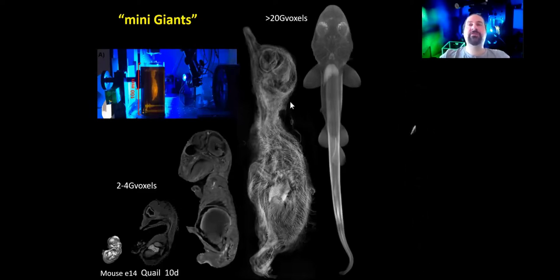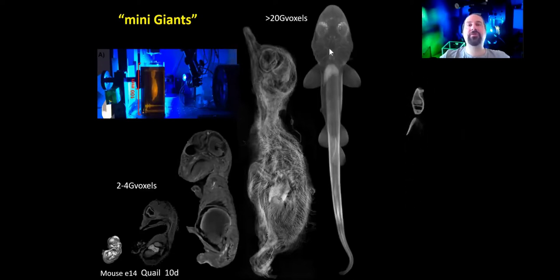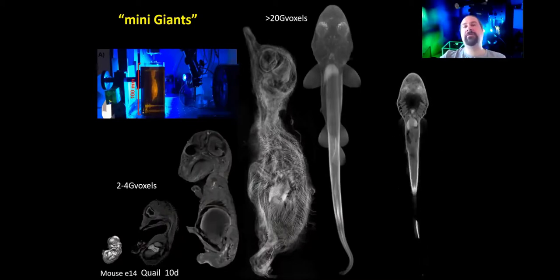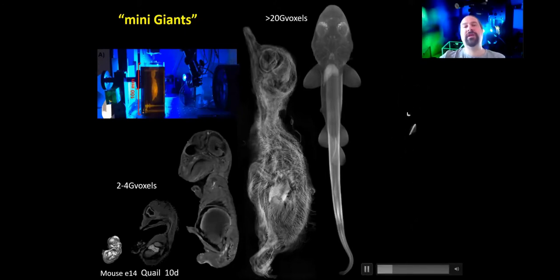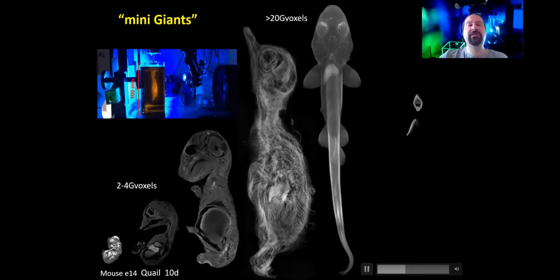And more recently, through a collaboration with a colleague, we actually started looking at these shark embryos. And this is one of the later stages that we've done. It's actually like a day after being born. It's more than 10 centimeters long, actually. And you can see that with the optical tomography technique you've been seeing here in this movie, you can see all of the anatomical details inside with the resolutions down to 10, 15 microns. You don't get that much resolution from looking at this image, but I will show you in a moment the level of detail you can get when everything works beautifully.